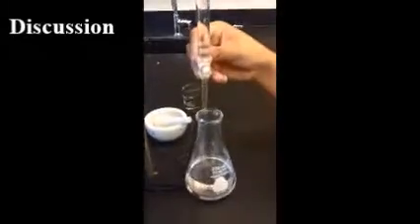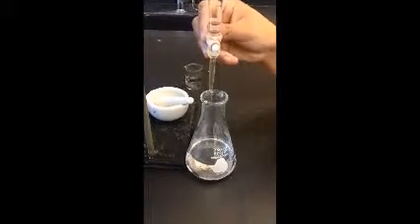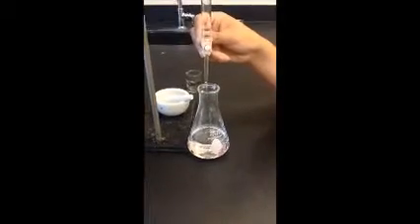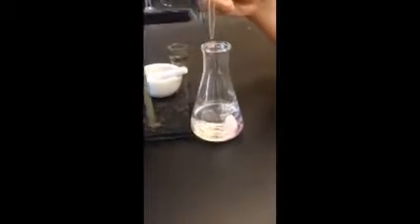We determined that the neutralization point was between 29.5 milliliters and 30.4 milliliters because the solution was too light when we added 29.5 milliliters and it was too dark when we added 30.4 milliliters. So the neutralization point had to be somewhere between those 2 points.